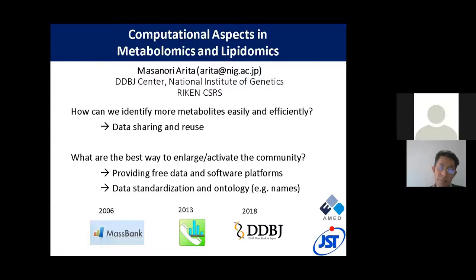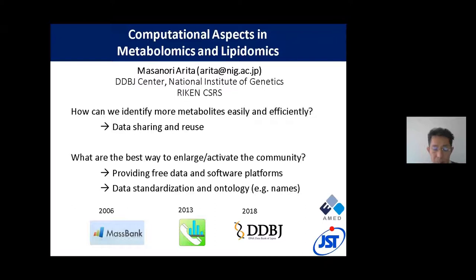After that, I started to work on computational software programs, and the most well-known is called MS-DIAL. The developer is Dr. Hiroshi Tsugawa in my team at Riken. This software program has been used by more than 1,000 research groups all over the world. In association with MS-DIAL, we also provide various spectral libraries for identification. This is the reason why MS-DIAL became so widespread and exploited. It comes with a very big spectral library, and identification of compounds was made much easier.